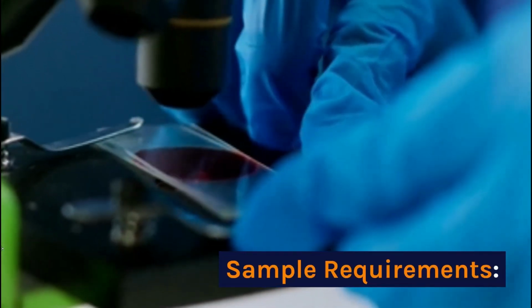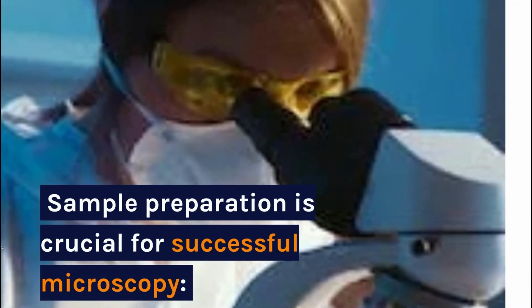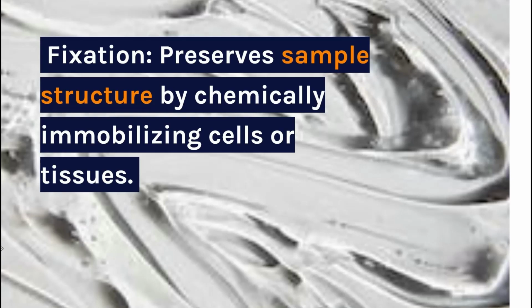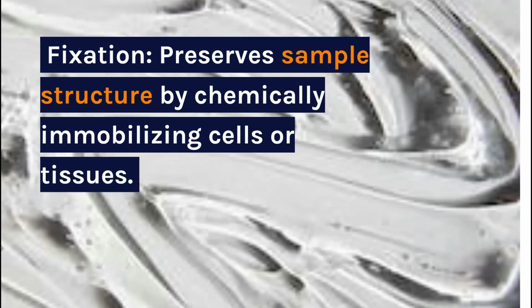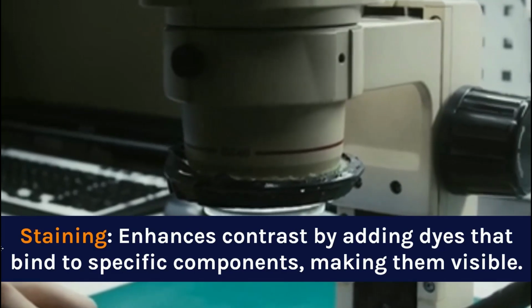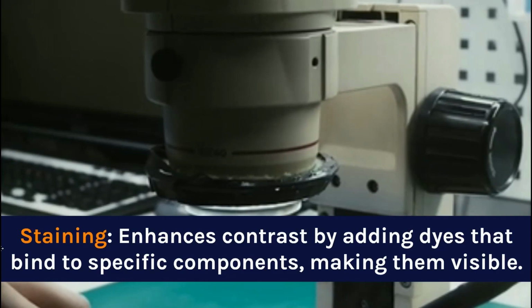Sample requirements. Sample preparation is crucial for successful microscopy. Fixation preserves sample structure by chemically immobilizing cells or tissues. Staining enhances contrast by adding dyes that bind to specific components, making them visible.